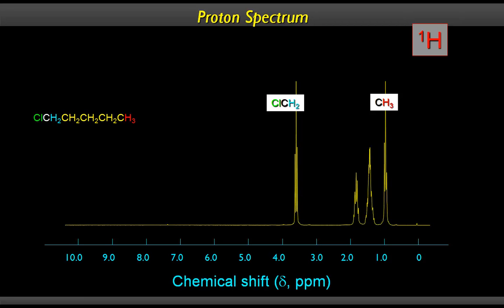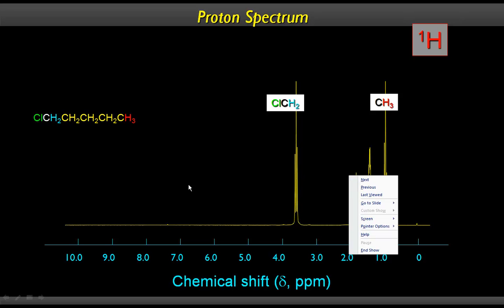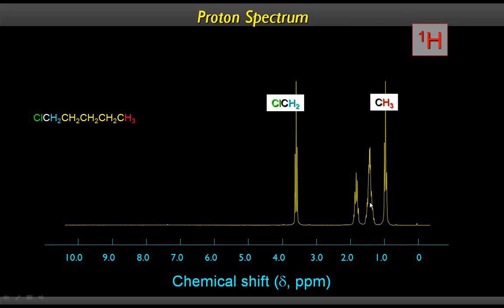This is the proton NMR. Proton NMR does give some valuable information that carbon NMR doesn't give, but carbon NMR is also valuable, in that it tells us some information more quickly than the proton NMR. For example, we have four peaks here, but there are 5 chemically non-equivalent nuclei, and some of them are overlapping. This is because of the two methylenes that you see here. That's not a problem in the case of carbon NMR.